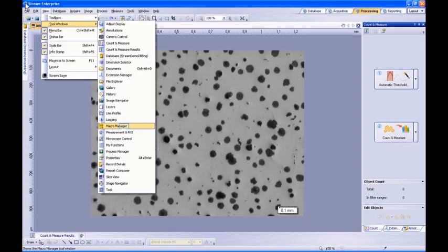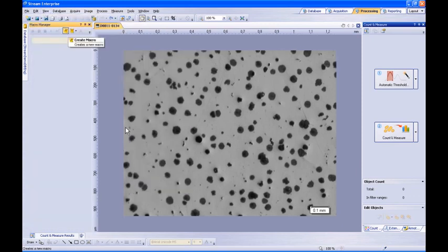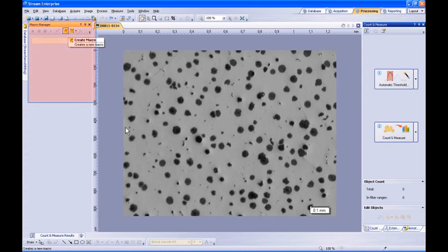First, we need to create a tool window for the MacroManager. This can be easily accessed from the menu View, Tool Windows, MacroManager. You will now notice a tool window on your desktop for the MacroManager.